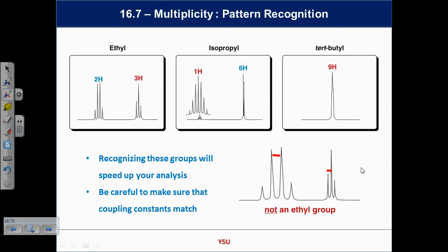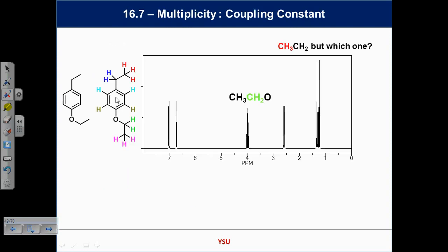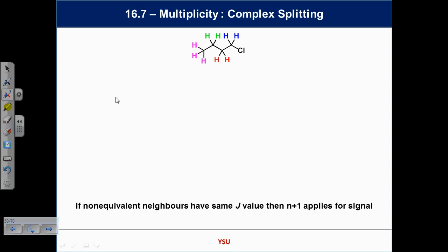And that J value then tells you an awful lot. So the gaps between these lines here, this is the blow up, don't forget, is the same as the gap right there, if they are talking to each other. That becomes very useful. Now, we did talk about the use of J values. We talked about being able to analyze these signals and these spectra to a great degree, so you're absolutely happy with what's happening here. In pharmaceutical chemistry, this is very important to know exactly what the shape of the molecule is and where the protons are relative to each other. So use J values as you need to.